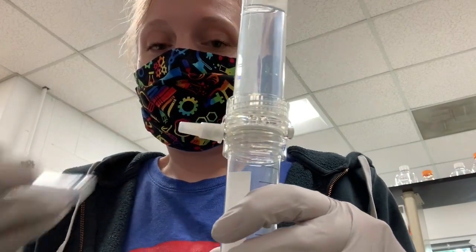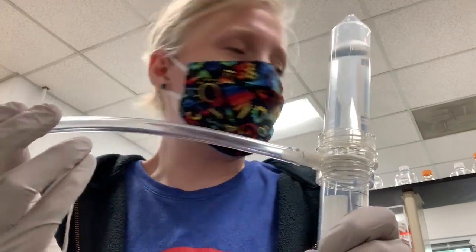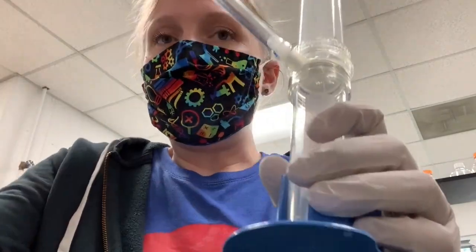Now this outlet right here can stick to a tube, and I just have one of these pieces of tube. This is usually by my bench or by the bench across from me. And this can plug into a vacuum outlet. So I'm going to plug it in and then I'll show it to you.